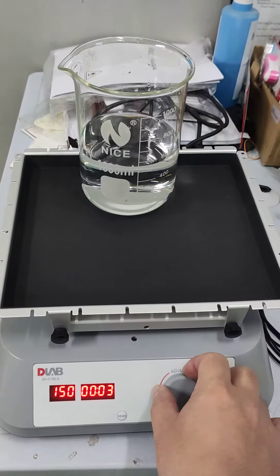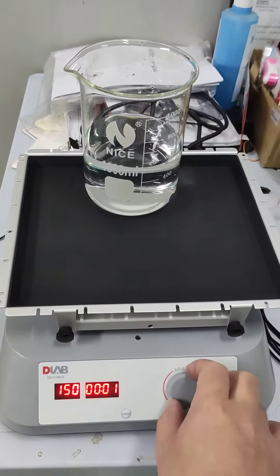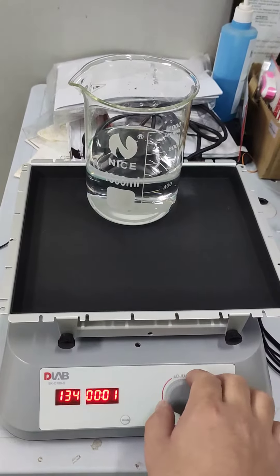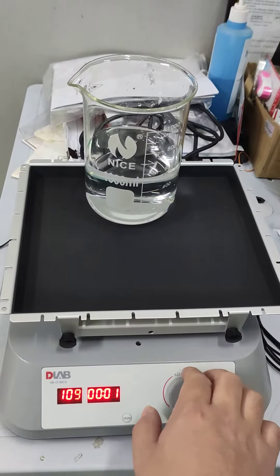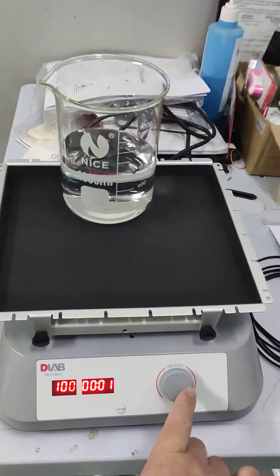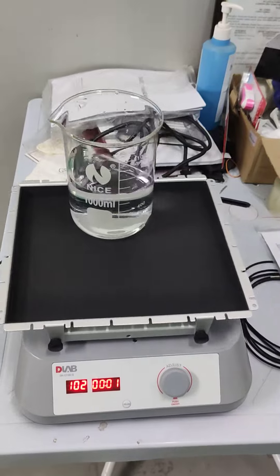Let's get started. Let it warm for one minute.